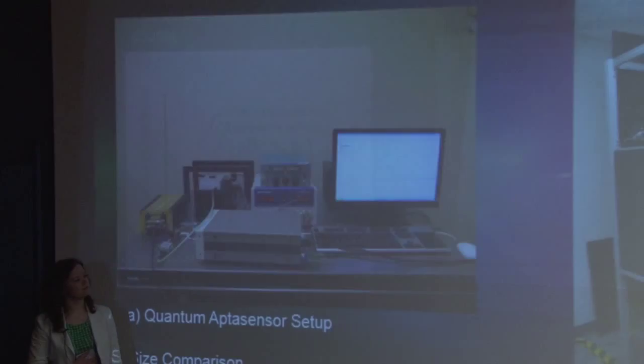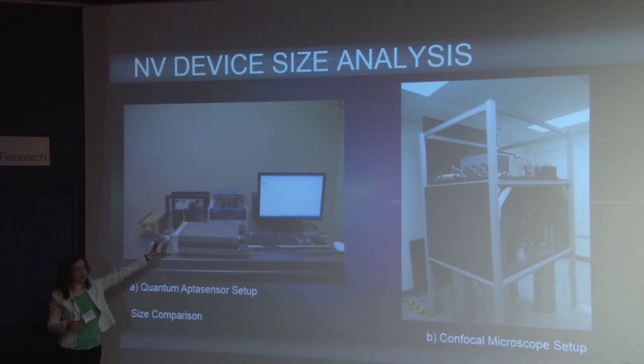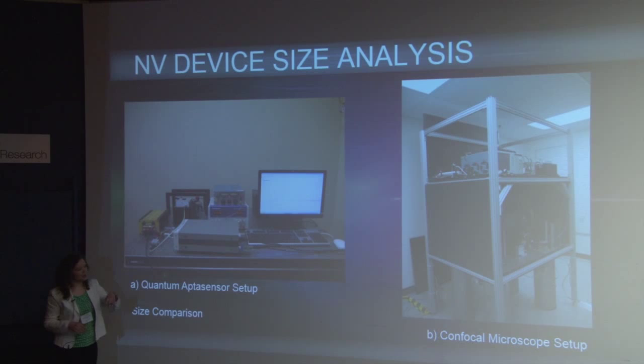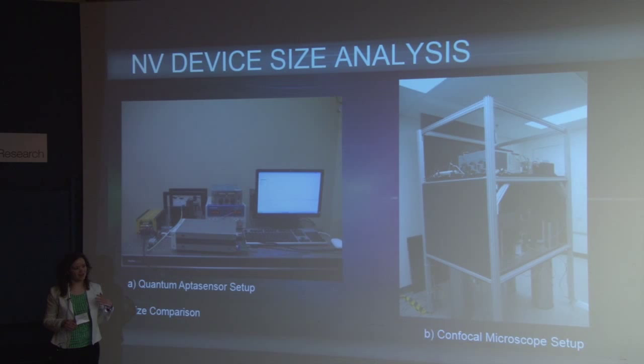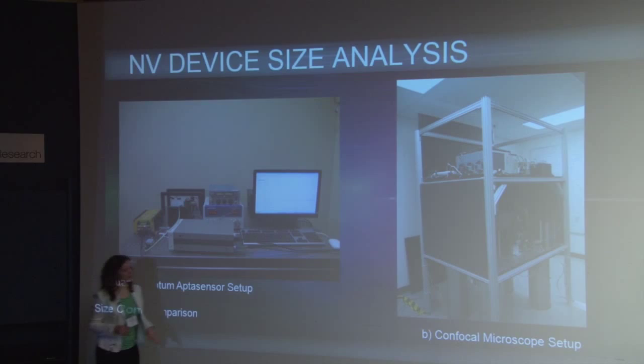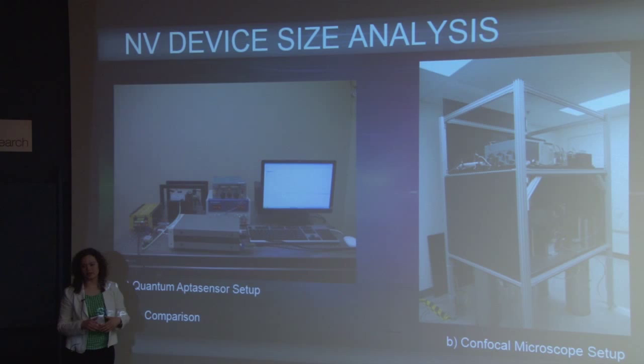I did mention the compactness of our setup, so this is just to put a visual representation to that. On the left here shows our setup, and as you can see, it fits on just a regular lab bench, including our computer. On the right is a typical setup that is used to do similar tests to the test that we've conducted. We have another picture of one of our lab mates standing beside it, but he's about the same height as me, and his head comes up to about here. So it's quite large and bulky. We've been able to shrink that down to a size that's quite portable and can be taken. Well, we took it here today.